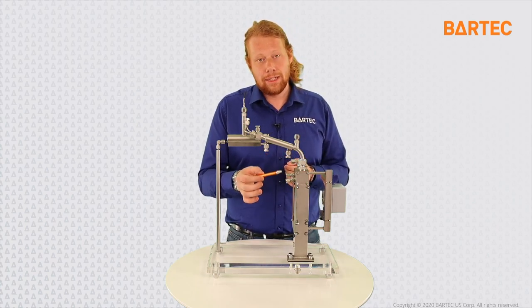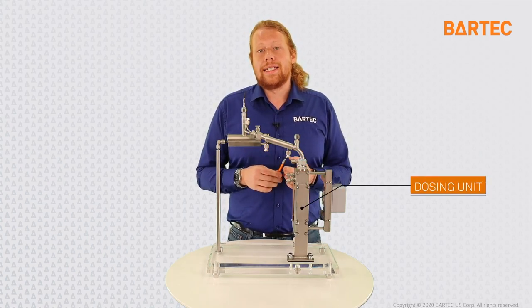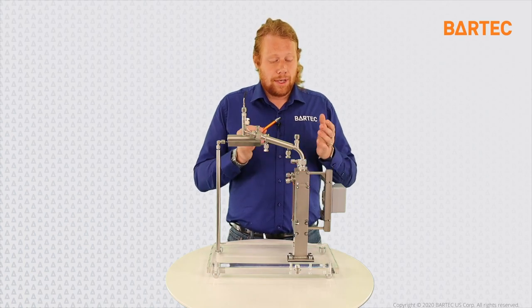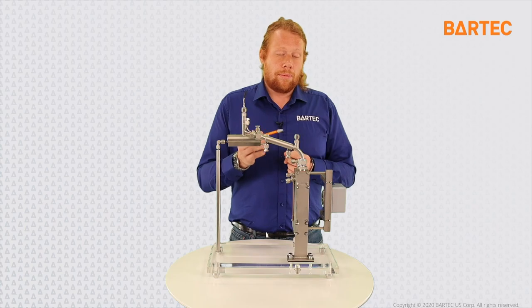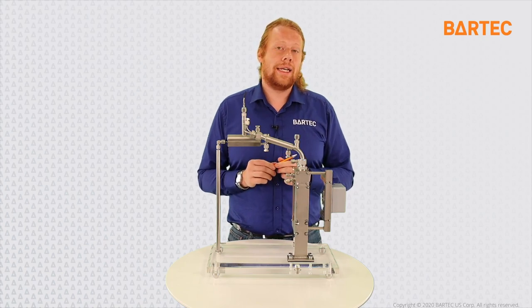In parallel of the receiving unit, we have a dosing unit. The dosing unit is another glass capillary that is used, as the name suggests, to dose the sample in preparation for the next analysis that is going to happen. Both the receiving unit and the dosing unit are monitored by the camera simultaneously and continuously.